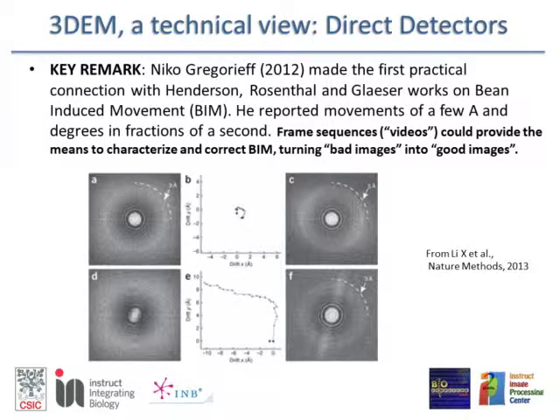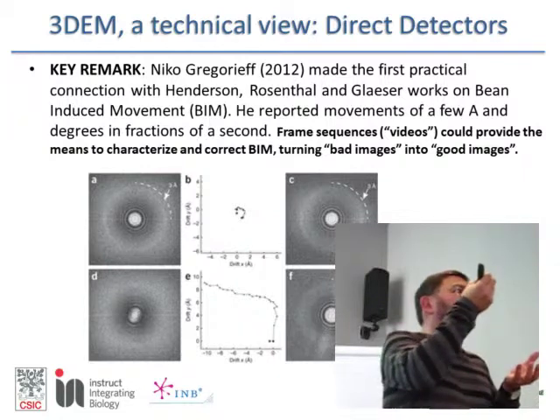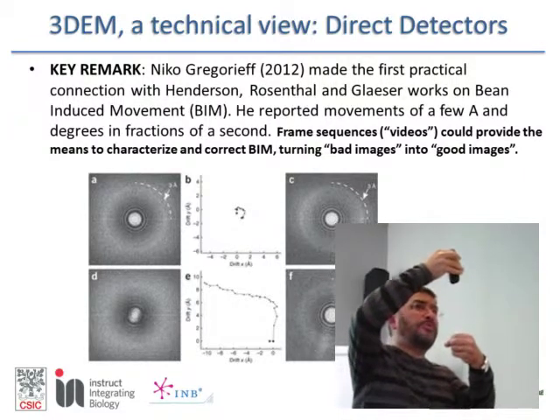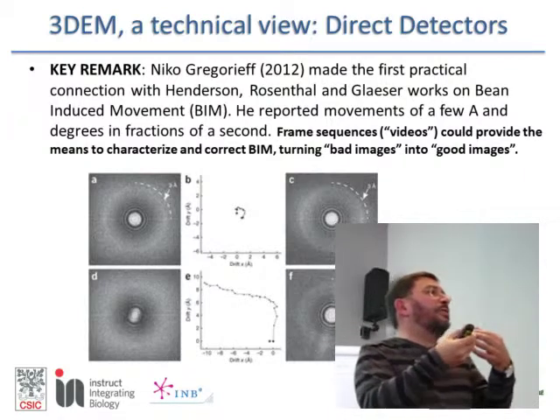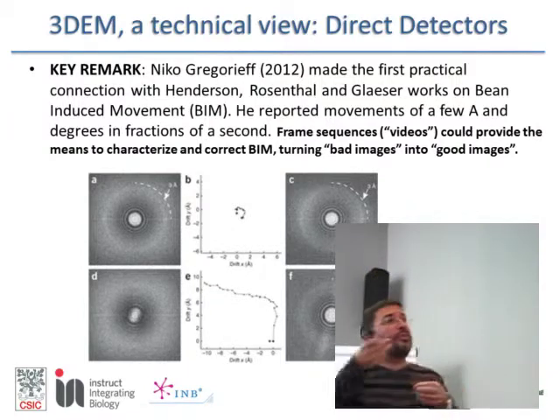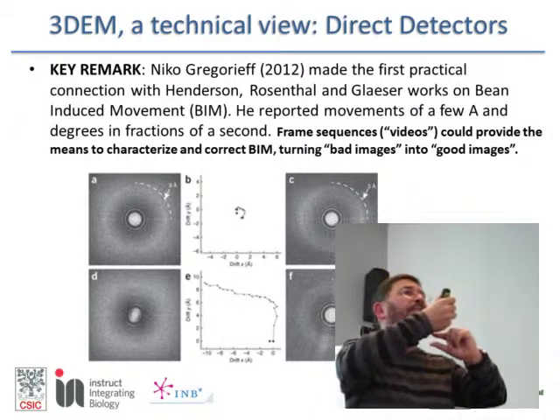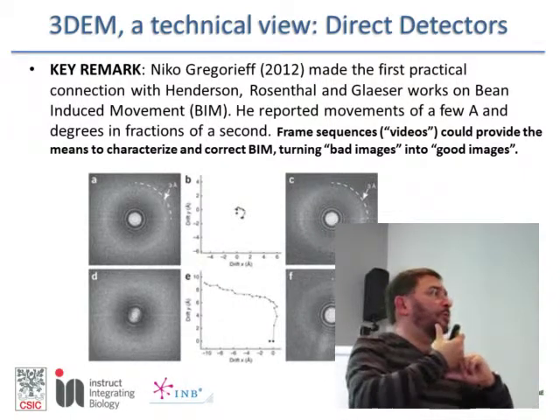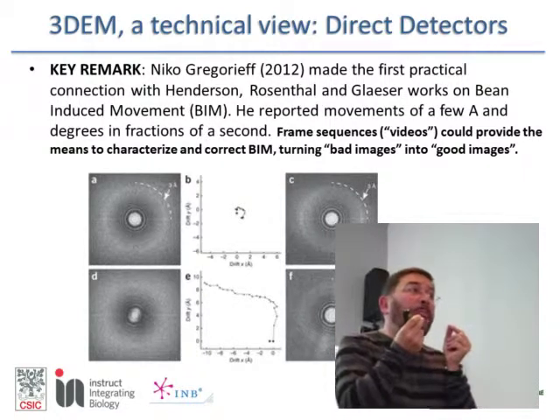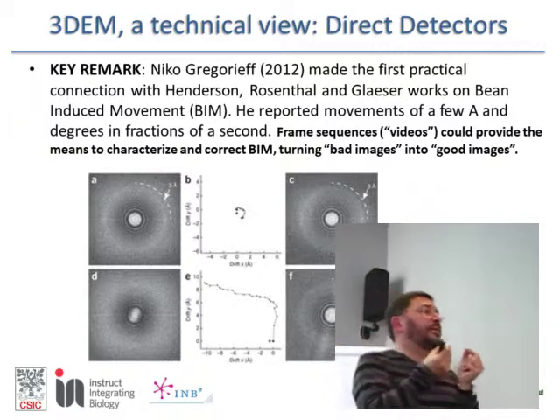in the preparation. Normally, I didn't talk about that, but in the electron microscope, and I suppose you know, the electrons have to go through vacuum. You have the source of electrons, and you have the specimen, and you have to make the vacuum in between. So the specimen has to be protected with some stain. Some of you have made negative stains. Some of you have even gone to cryomicroscopy and been able to make a solid thing, to put a solid specimen in the electron column. Okay? What we were not expecting so much was that as this block of solid ice or block of salt of uranium were irradiated, it was moving.